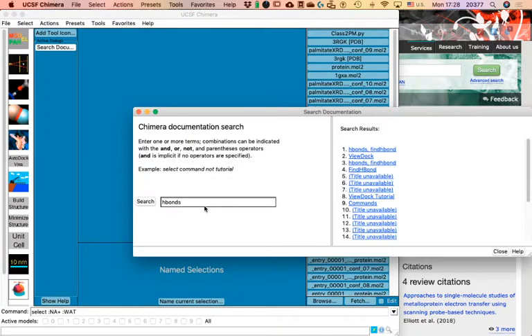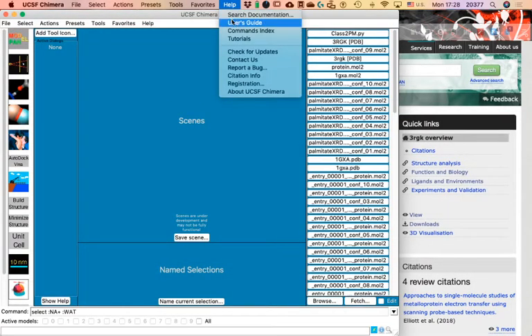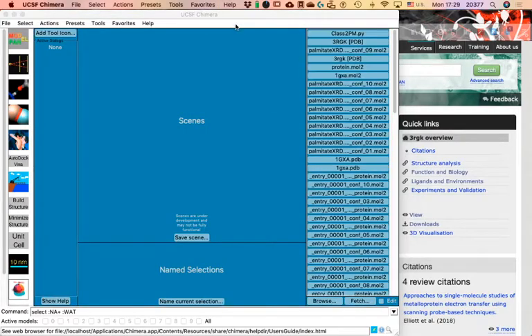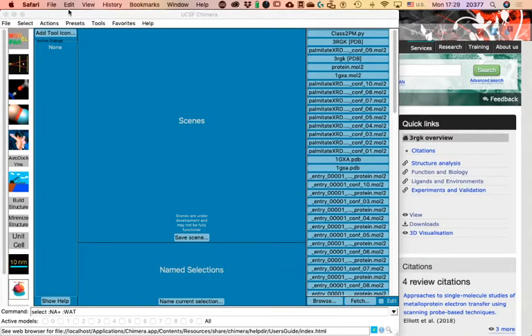If you search 'H Bonds,' for example, it gives useful results — Find H Bonds, View H Bonds, and several other things. If you go to the User Guide, it actually takes you to the user guide web page. This help I usually find very useful.